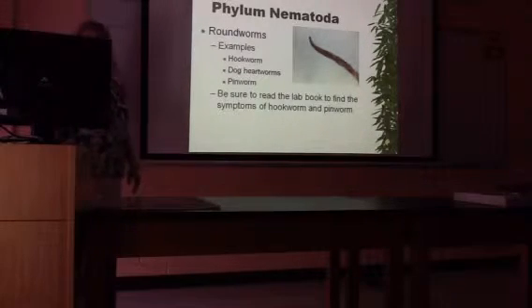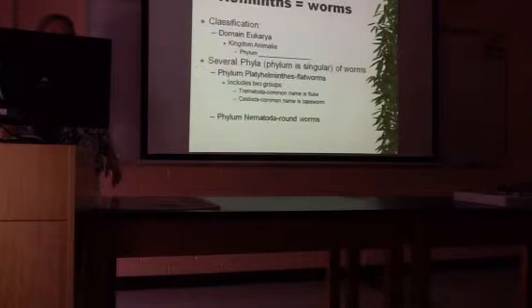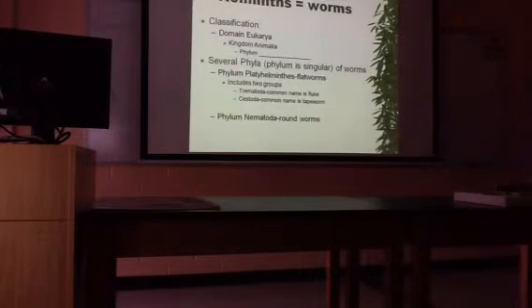All right, so what we're not going to do for this lab is go through every single slide and have you tell them apart. That's because for this lab only, lab 5, I'm not going to make you identify each slide by name. If you flip over to that materials page, lab 5, it's on page 41. When you look at these slides, you're not looking at them to identify them by name.